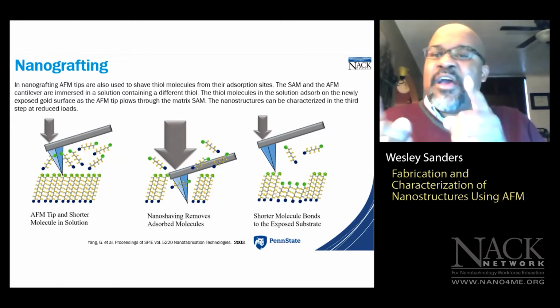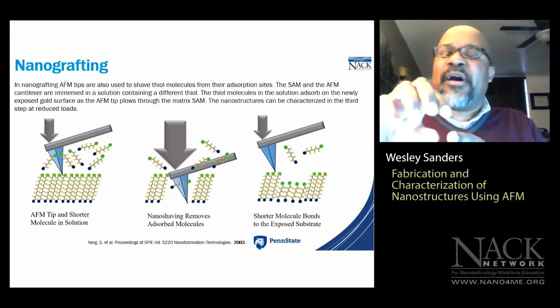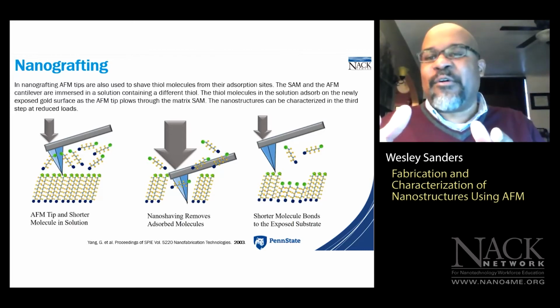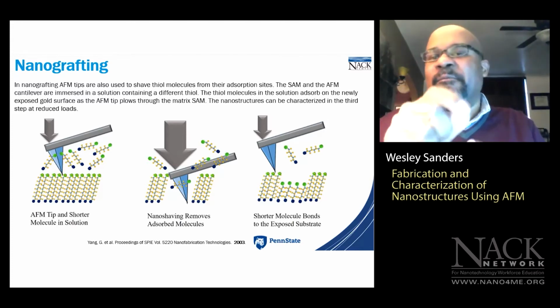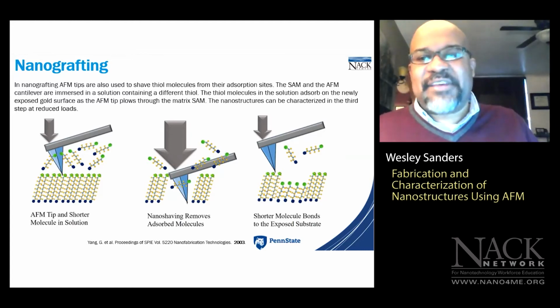Let's say you want to use a small glass substrate coated in gold. And then you assemble a self-assembled monolayer on your gold film. And on that 1 square inch wafer, let's say you want 5 different regions, each with a different sensing specificity.